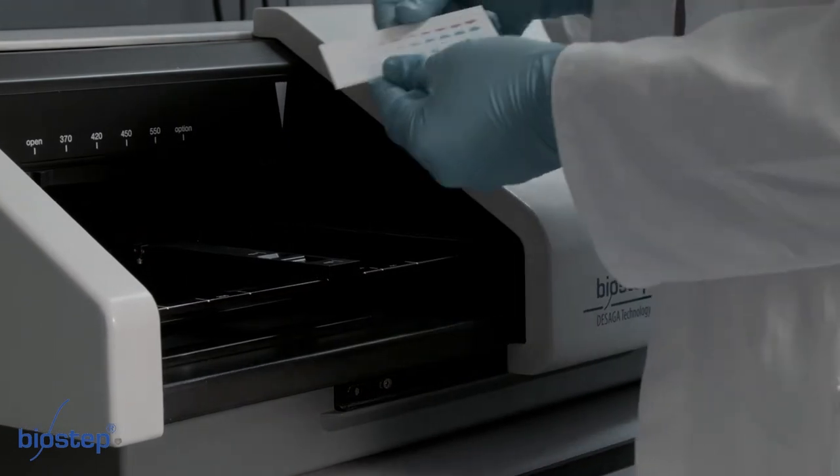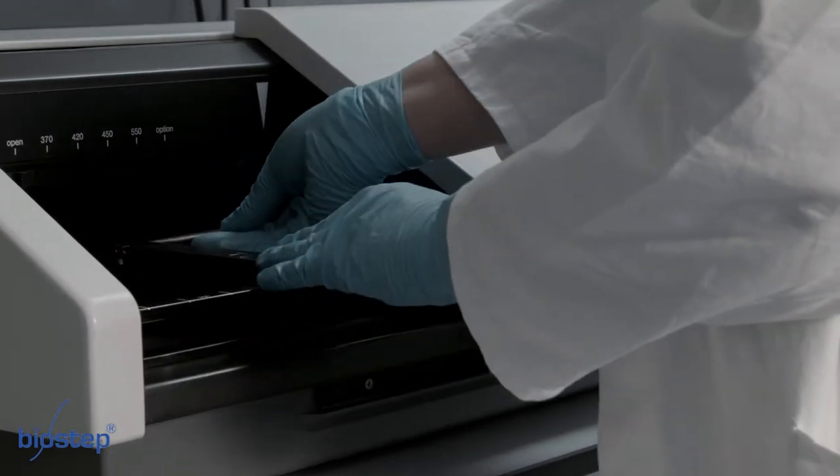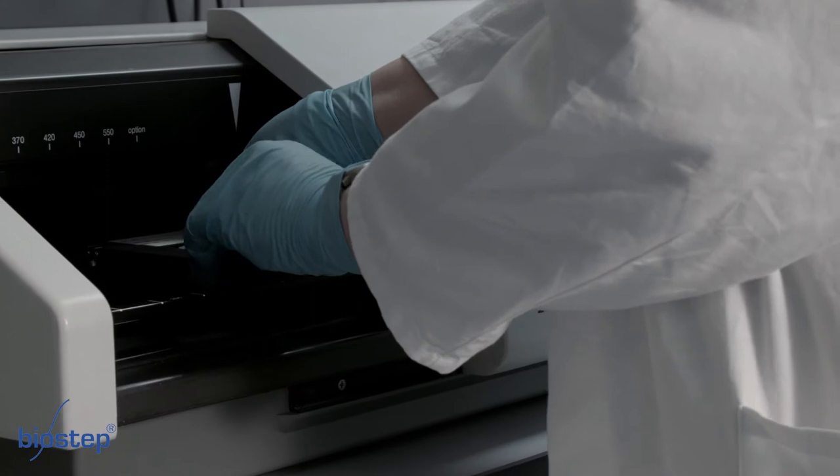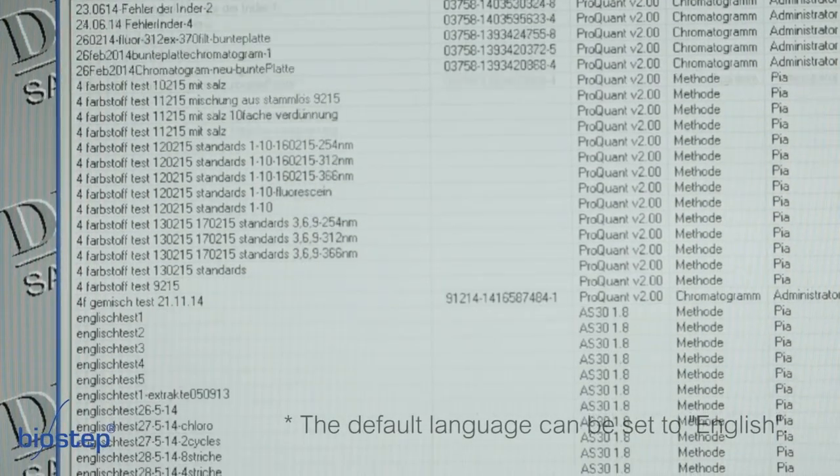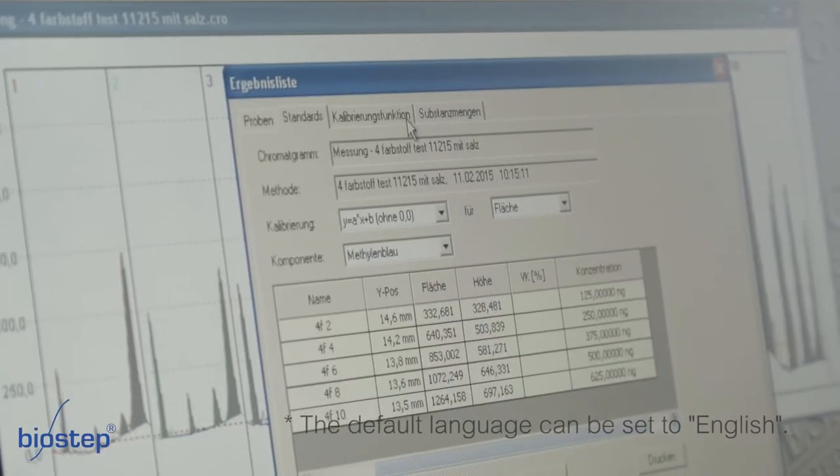The advantage is the possibility of transferring the application methods from the AS30 software to the CD60 analysis software, and therefore positions, samples and amounts are already known.